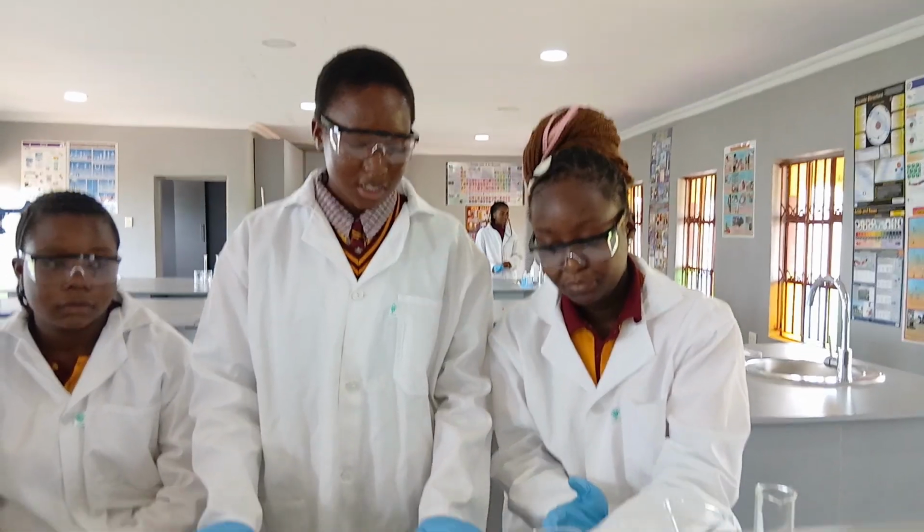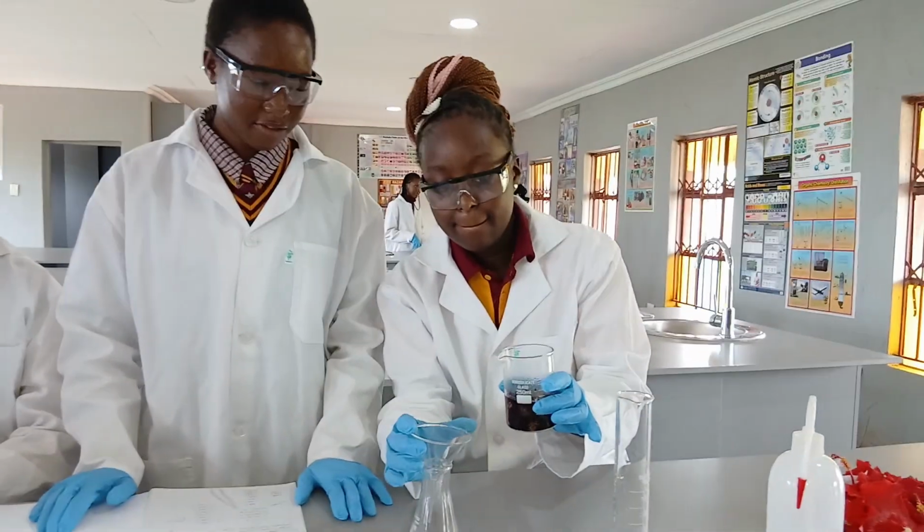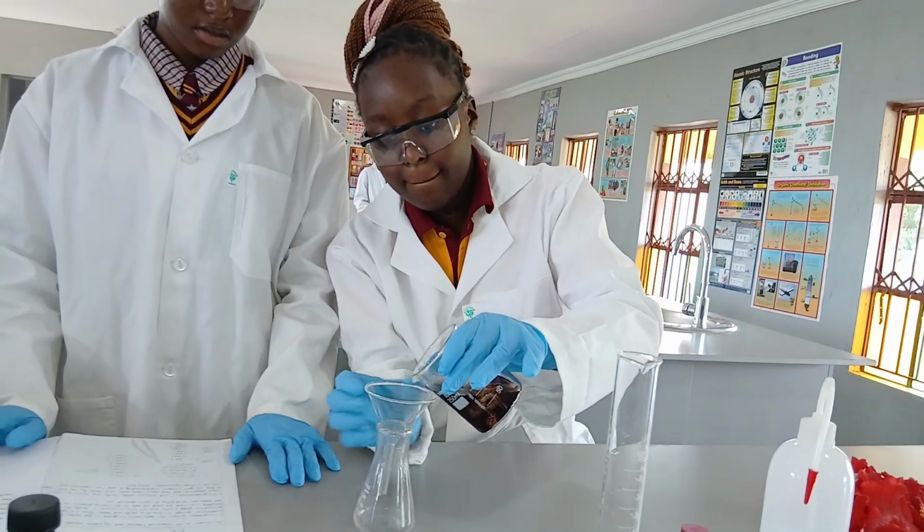Now that our solution has cooled down, we are going to decant it into our conical flask, and we're going to use a funnel to avoid spilling everything.